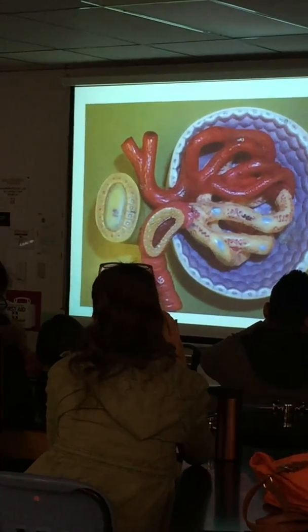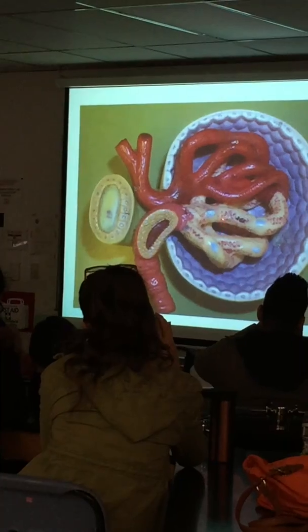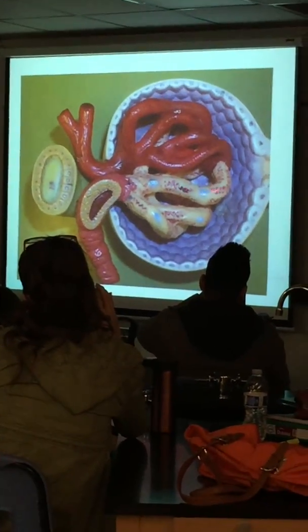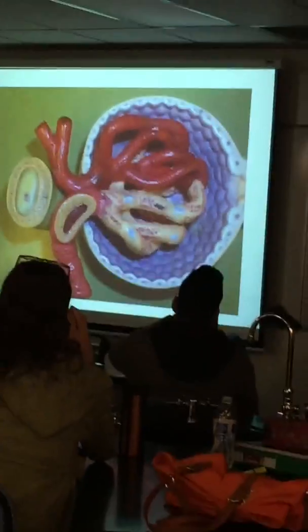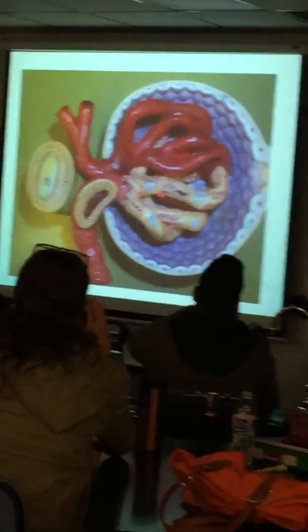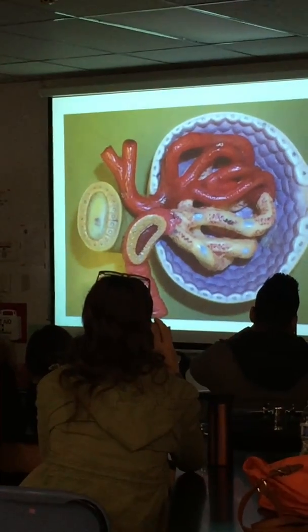On this one, you can see the nuclei of the podocytes, and you can even see the little slits. What do we call those slits? Filtration slits. Know that. These are just glomerular capillaries. Okay. You can also call this the visceral and the parietal layer of the Bowman's capsule. That's all I see there.